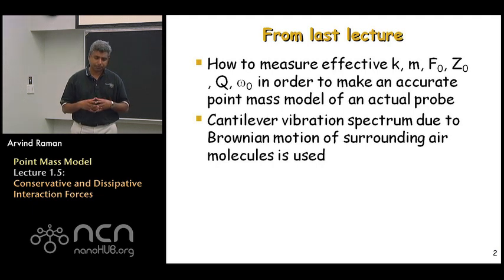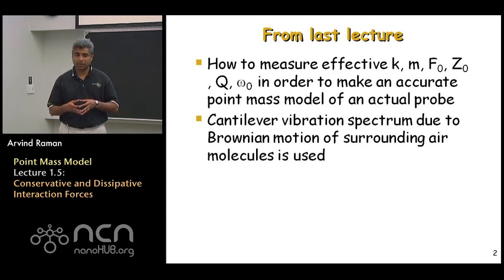But also, in the past few lectures, we've really stressed the fact that one needs to model the excitation of the cantilever very well as well. And the excitation of the cantilever, whether it's from dither piezo excitation or magnetic excitation, leads to a certain expression in the point mass oscillating models. They either appear as an external oscillating force, F naught, in the case of directly excited cantilevers, or in the case of base excited cantilevers, it appears as a base motion in the point mass oscillator model.